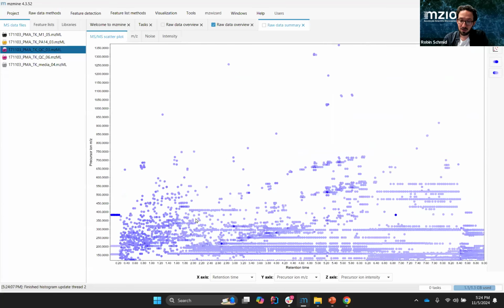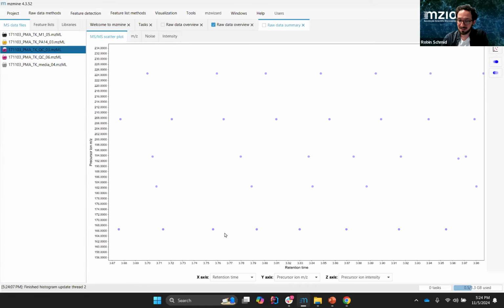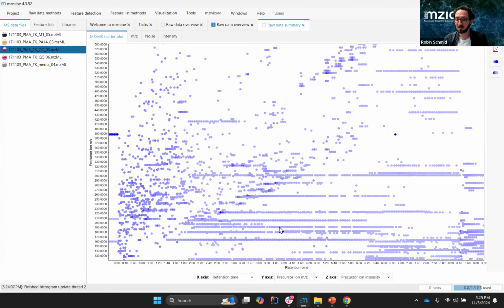And then in the later range, in this data set at least, there's a couple of different m/z values that are picked too often. We can really see that dynamic exclusion was applied, because there's a distance between those MS2 spectra being picked. So there's maybe a 2 second, 3 second gap between those acquisitions. But honestly, in the next run, if I acquire the data again, I would maybe exclude these masses and just make a static exclusion list. And this is a very easy way you can already interrogate your data.